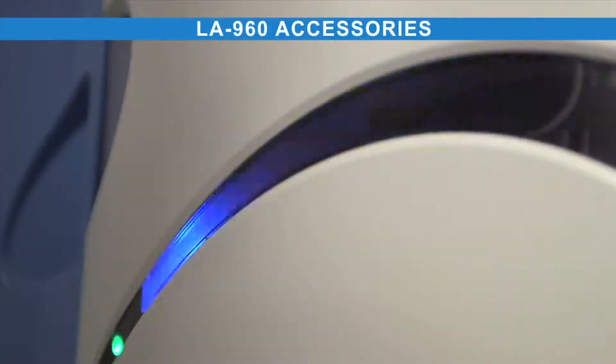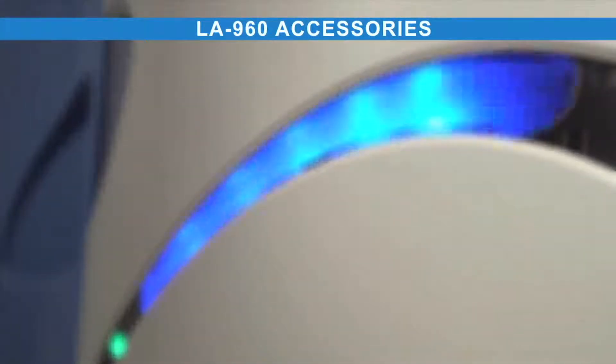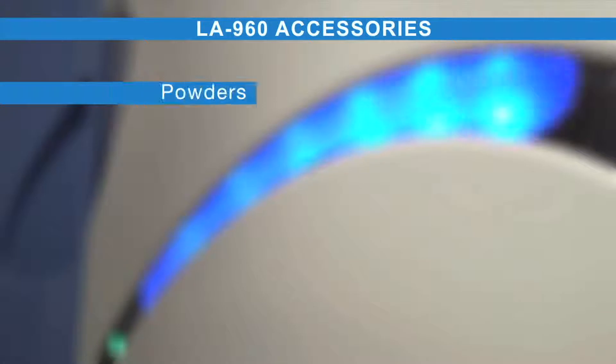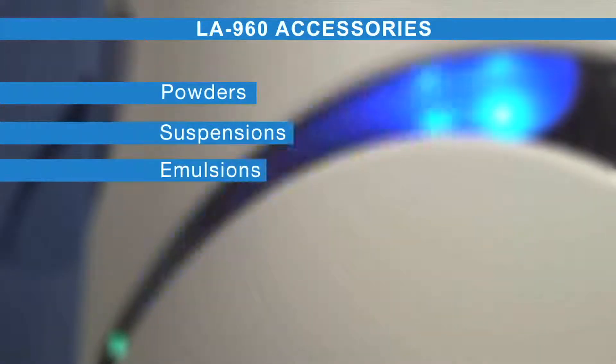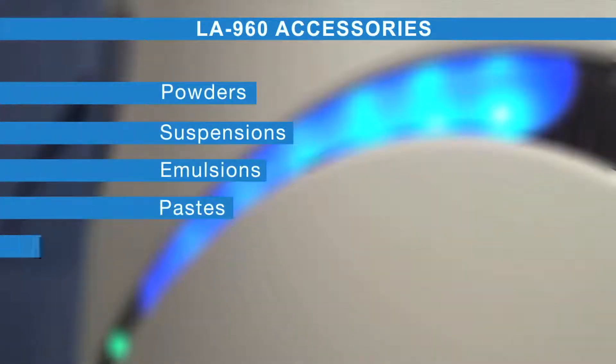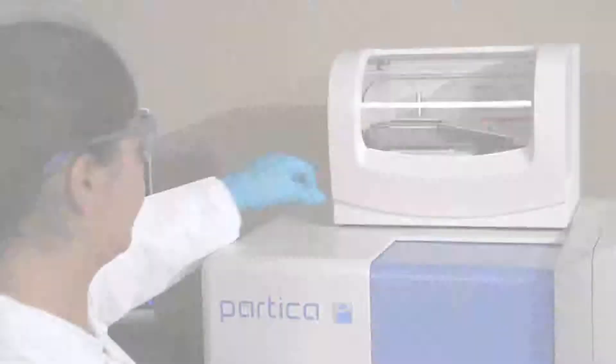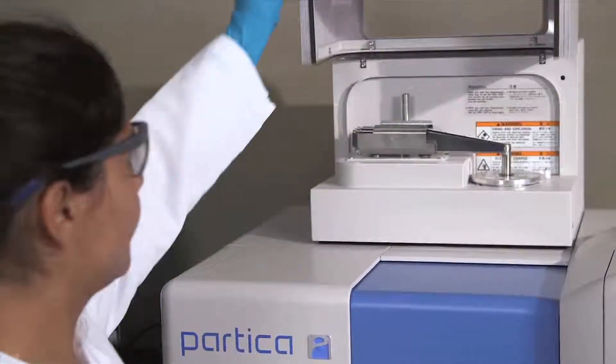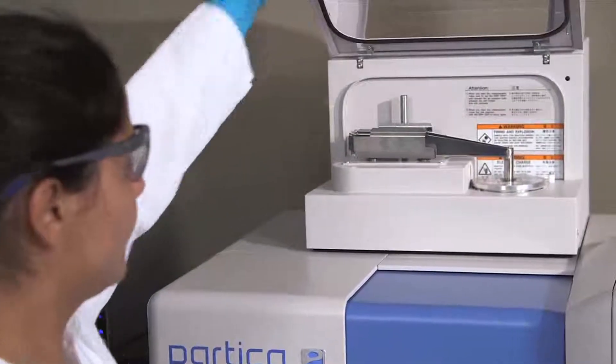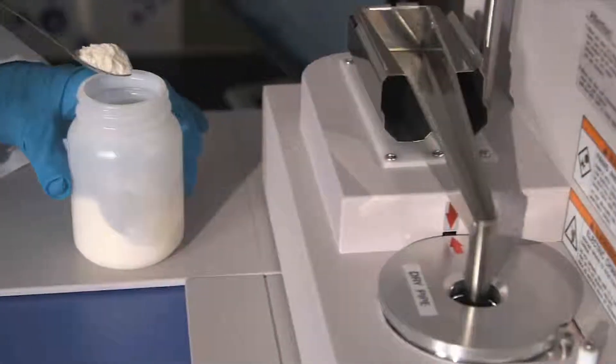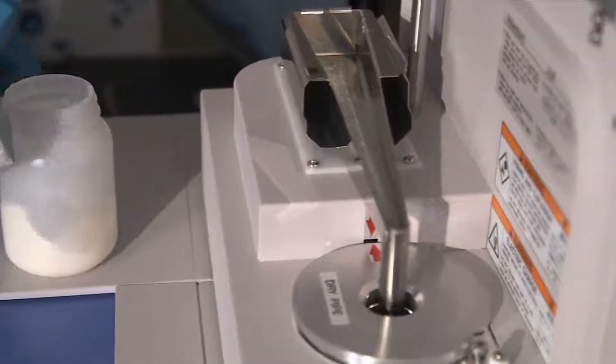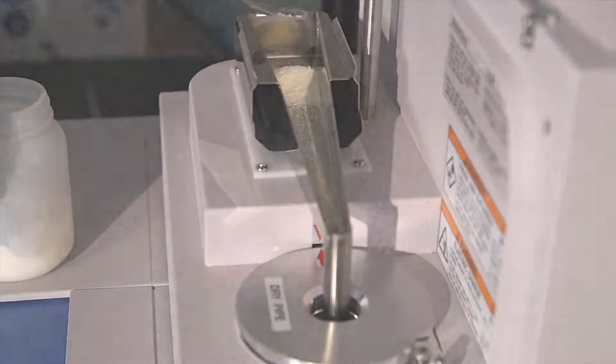The modular LA960 can be outfitted with a number of accessories enabling analysis of powders, suspensions, emulsions, pastes, gels, and creams. The powder jet accessory uses a unique self-adjusted sample flow to ensure reproducible dry powder measurements for even the most agglomerated powders.